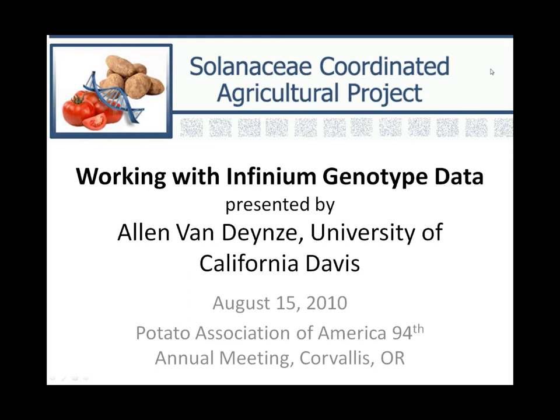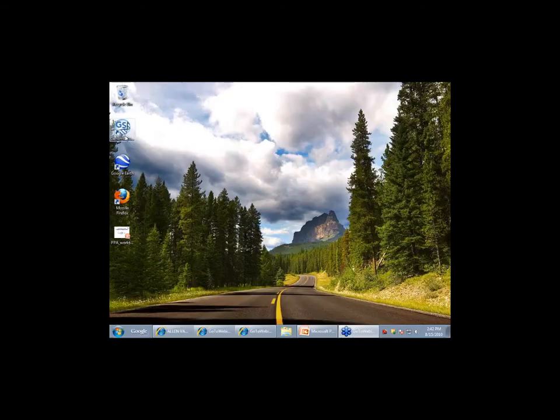So if everybody can click on the Genome Studio icon, it should be at the top left of your computer, we'll get started.